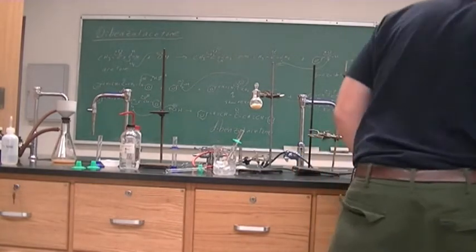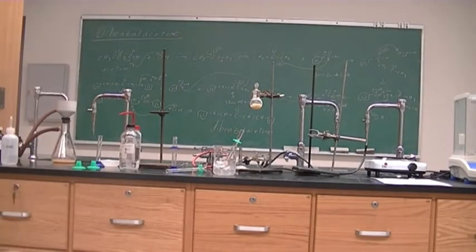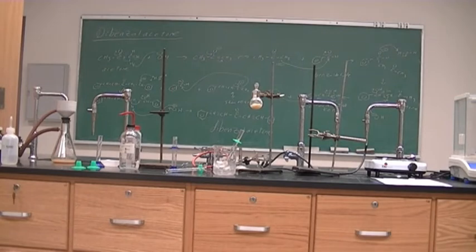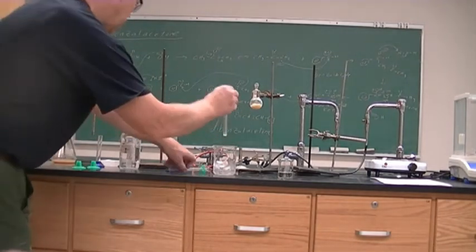So I'm going to get a beaker for the ethyl acetate.